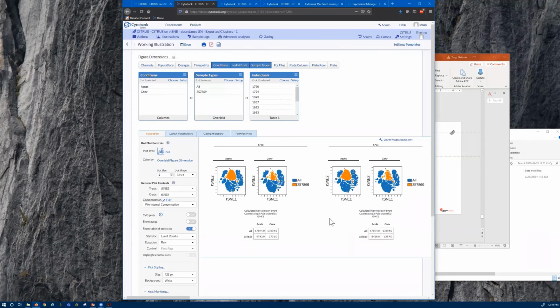Thank you, Steph. Since we're on the same topic, I'm just going to ask you another question. Does it make a difference to use separate FCS files for each patient, or do you want to concatenate these for the whole group? Yeah, it definitely makes a difference. Where Citrus thrives is in dealing with groups of multiple samples. The things that we talked about, like cross-validation and predicting outcome, can only be done on groups of samples. So the statistical power of Citrus comes from having those replicates in your groups.